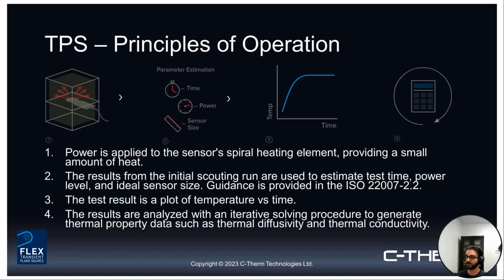So within the data that you've collected, you may need to adjust the region that you're analyzing to a specific condition within a certain boundary. Essentially, there's just a little bit more onus on you as the user to go through and validate your results. So it can take, I would say, a little bit more time to run through this process. But again, it is a very powerful tool and ultimately conforming to that ISO standard.